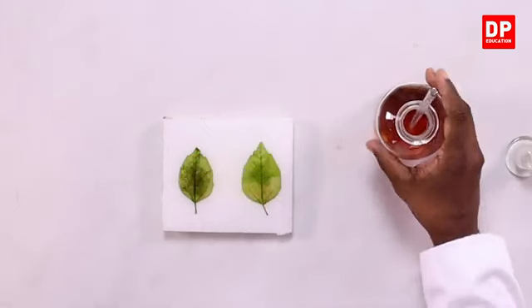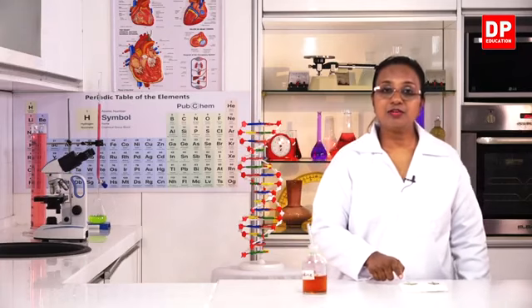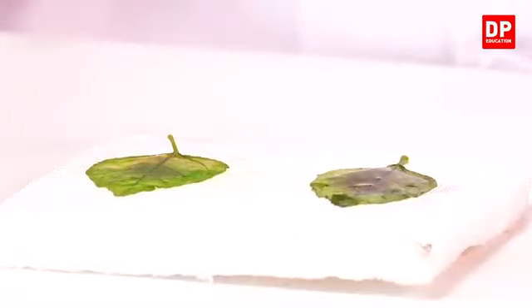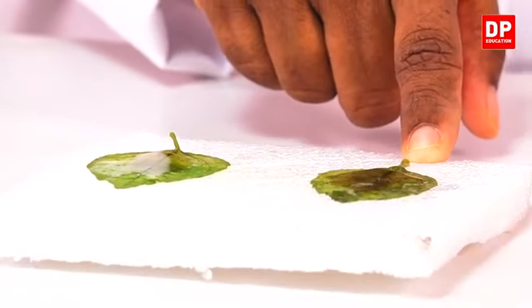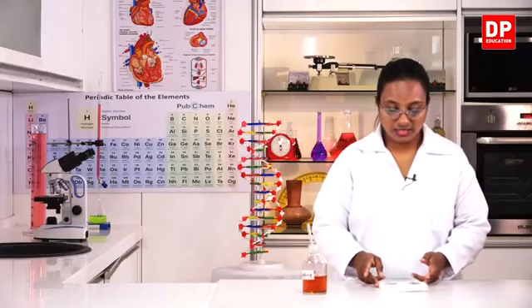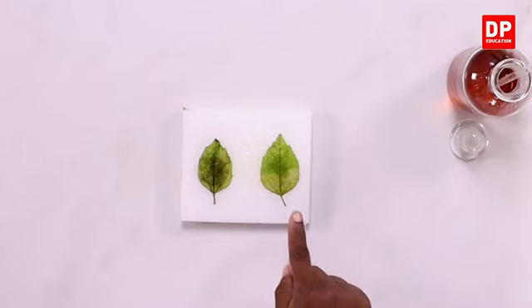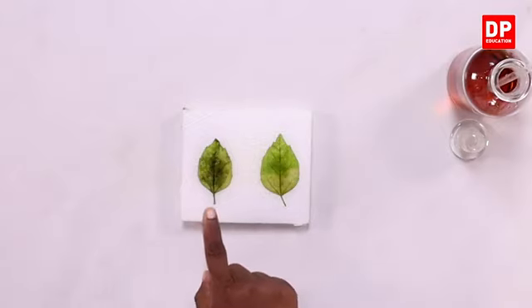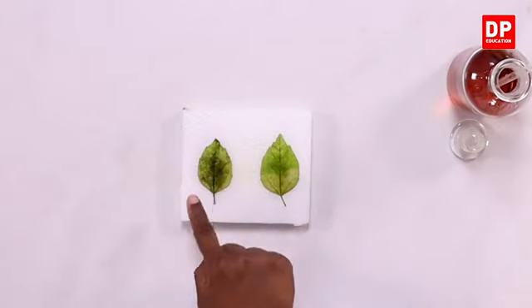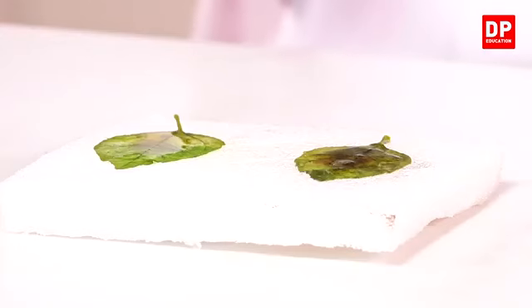So, here you can see, students, the leaf that was covered with black polythene, and the leaf that was covered with transparent polythene. Here there is no color change. The purple or dark blue color has not appeared. But here you can see there is the appearance of dark blue or purple color.